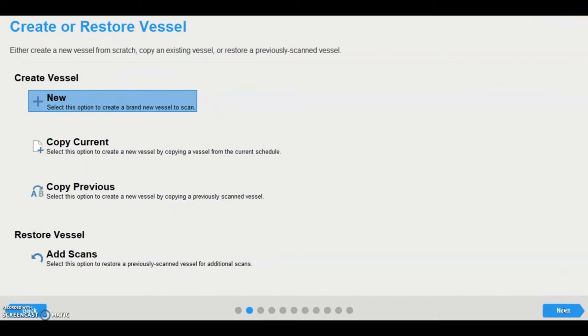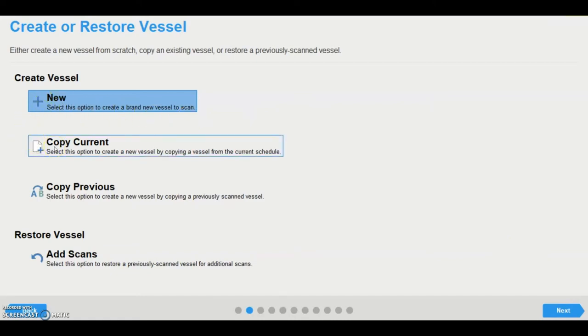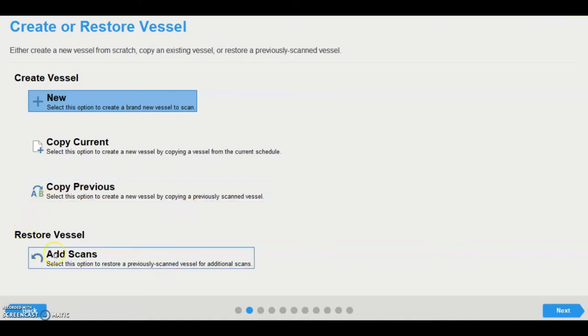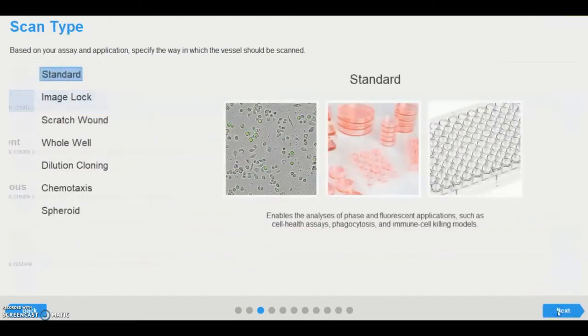Now the user has the choice to create a new vessel to scan, copy a current vessel that is currently scheduled, or copy the settings of a previously scanned vessel. There is also the option to restore a previously scanned vessel for additional scanning. The new scans are then added to the existing images in one experimental file. For now, we are going to choose Create New Vessel.